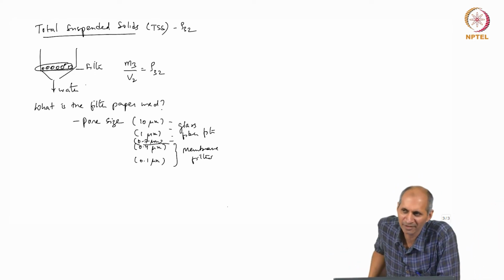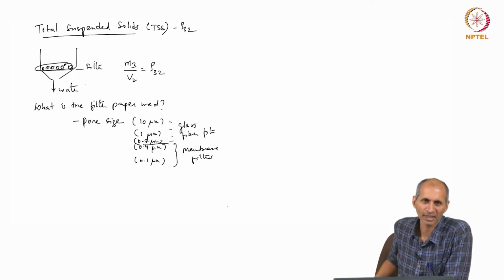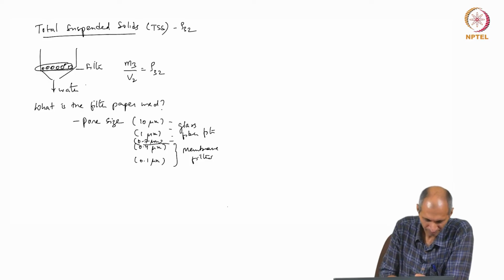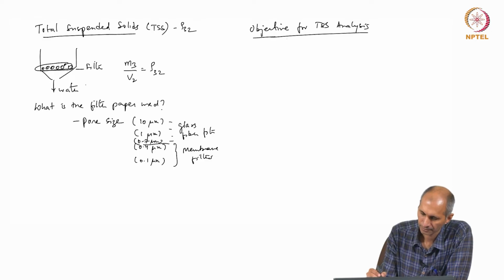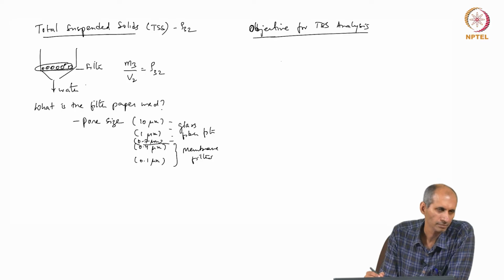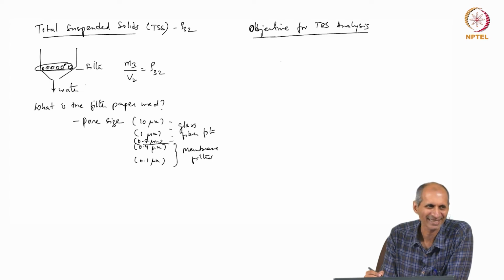What is your objective in analyzing TSS? The objective is, very simply, separation of solids.